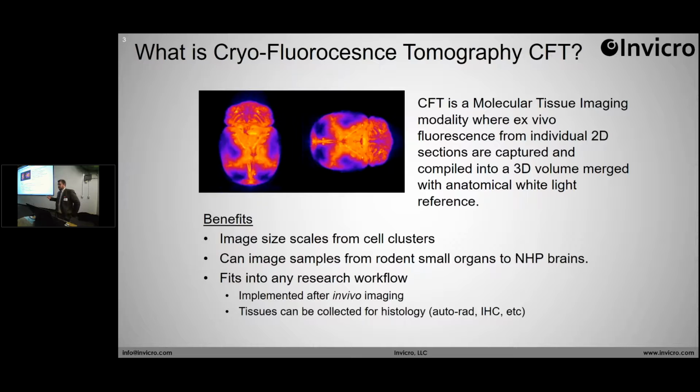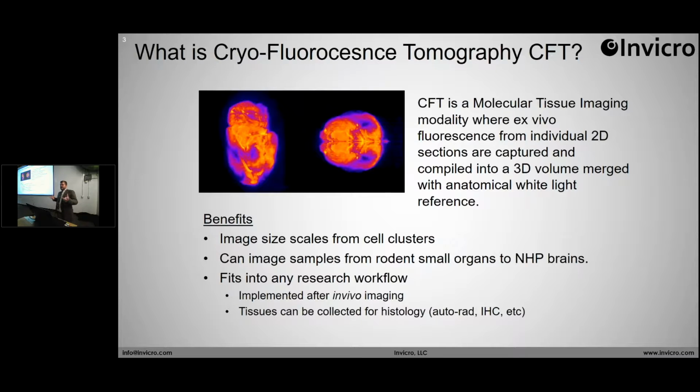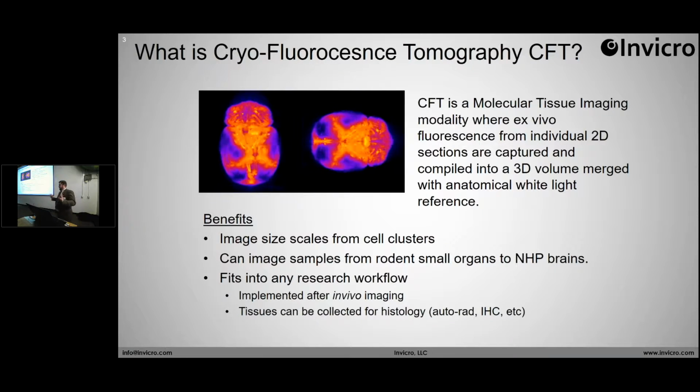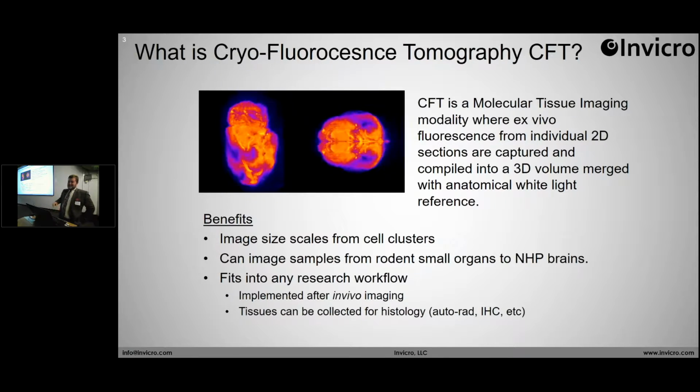So what is cryofluorescence tomography? CFT is a molecular tissue imaging modality where ex vivo fluorescence from individual 2D sections are captured and compiled into a 3D volume merged with anatomical white light reference. Very simple. We'll continue to unpack this slowly.